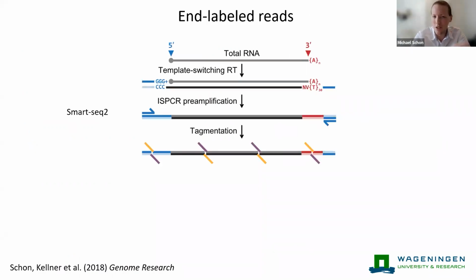But in order to do that, you actually have to have experimental 5' and 3' ends. And when I took a closer look at some single-cell sequencing protocols, this is an example of what's called SmartSeq2. It utilizes template switching onto what's called a template switching oligo that I'm showing here in blue, that after reverse transcription, the RT enzyme produces untemplated cytosines. Those can hybridize with a template switching oligo in solution, and you produce essentially an oligo tag at the 5' end of your cDNA.